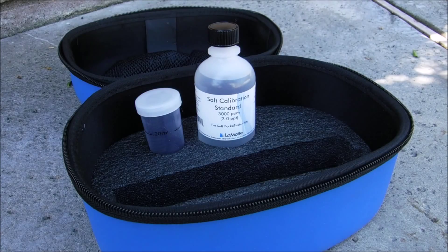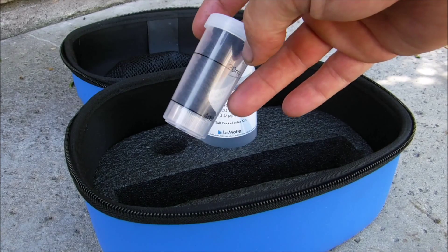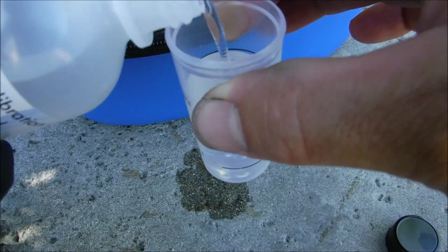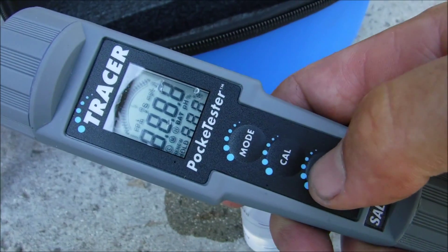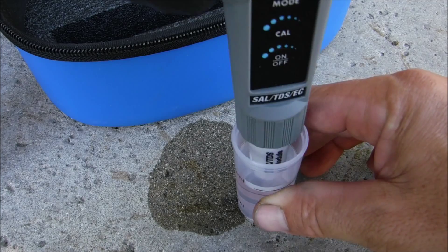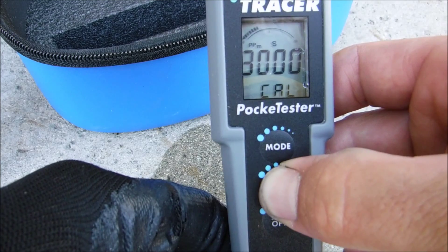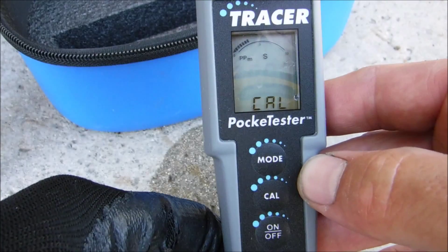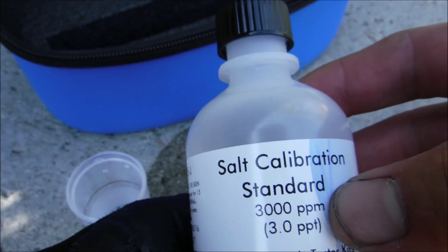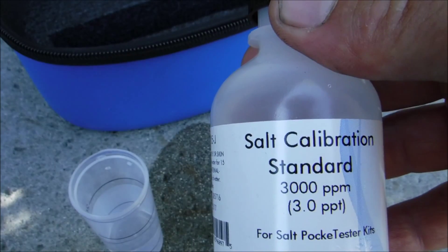Now you're ready to calibrate the Tracer. You're going to use the salt calibration standard and put it into the sample bottle up to the 20 ml mark. Pour in the calibration solution. Now I'm going to turn the unit on, set it in the calibration solution, and press and hold the calibration button. Once it flashes, it's calibrated — it should say 3000. This is a 3,000 parts per million calibration solution standard, so the unit should read 3000 on screen once it's calibrated.